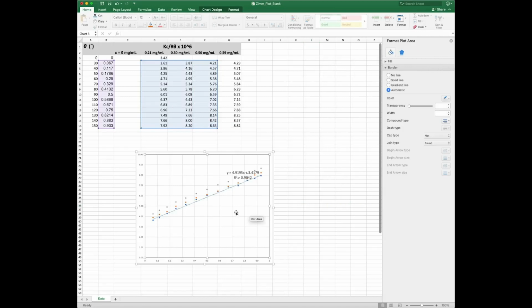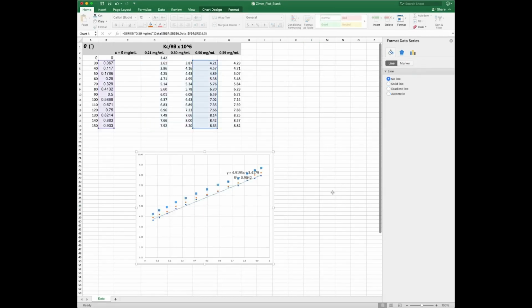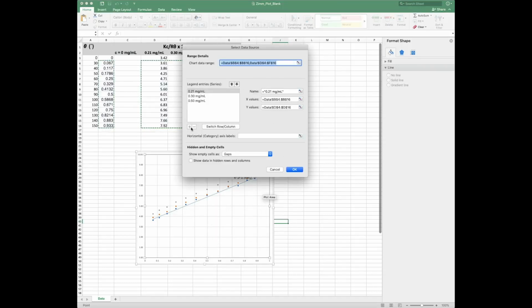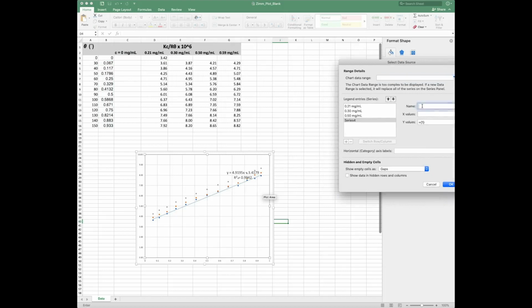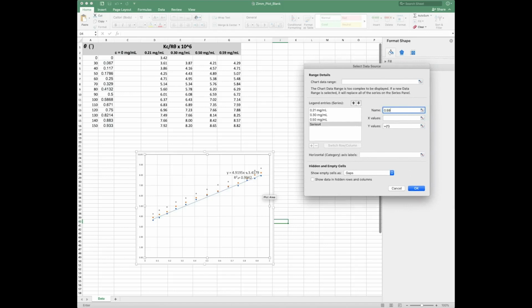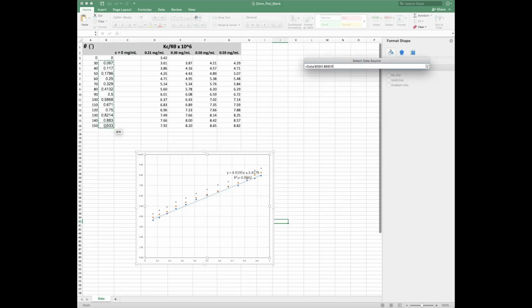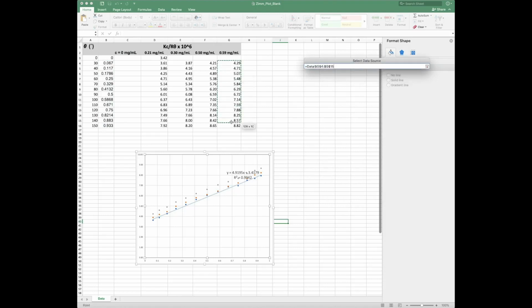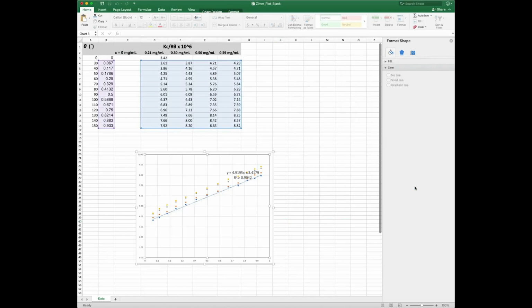And there we go. Here's the next set of light scattering data, just a very, very subtle change. Let's add in the last one. The last concentration that we have is 0.59 mg per mil. The x values here are all of these, and the y values are all of these. So you see it's going to look very similar to what we already have on here.